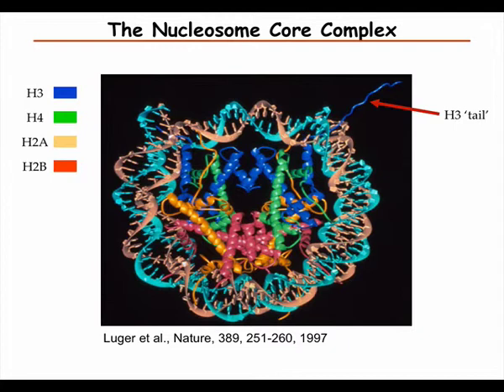One case has been histones, which are heavily modified, and the modifications are often used to regulate the nucleosomes. Here we really want to know the correlation between the modifications, to try to understand how this regulation happens from the modifications.